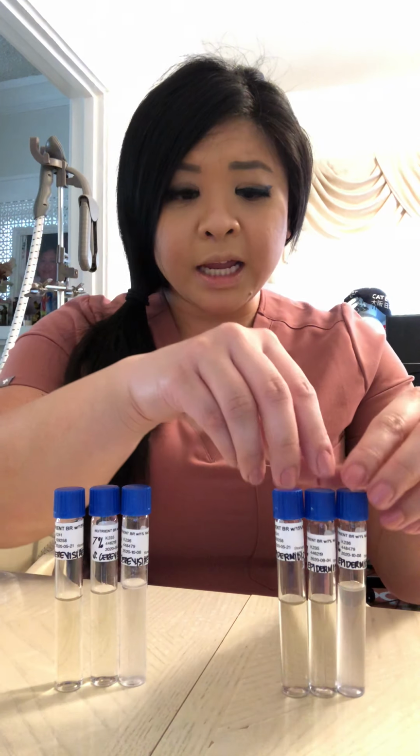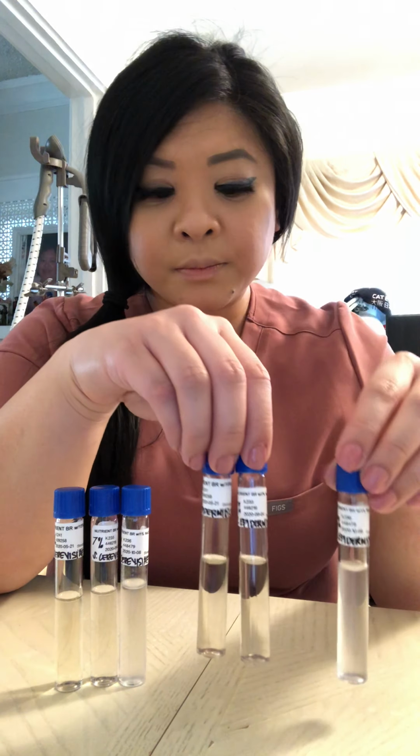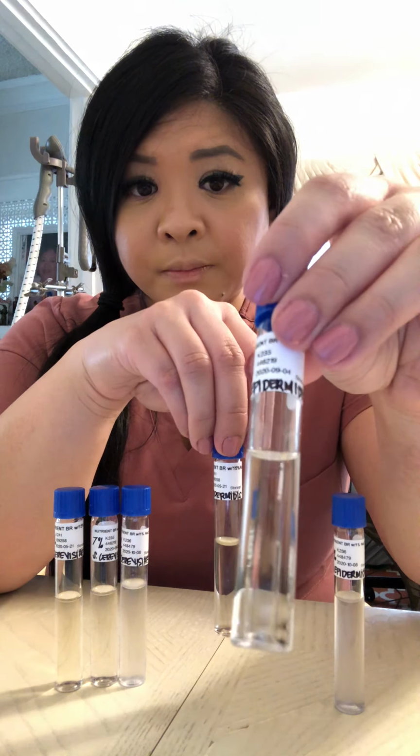So I have my vials, and I will start with my salt tolerance results. I have my S. epidermidis at 1%, 7%, and 15%.